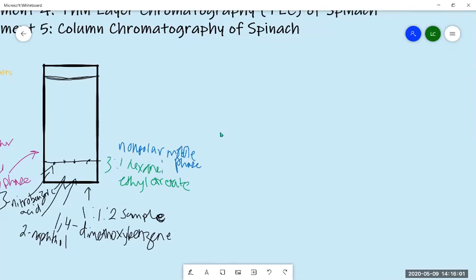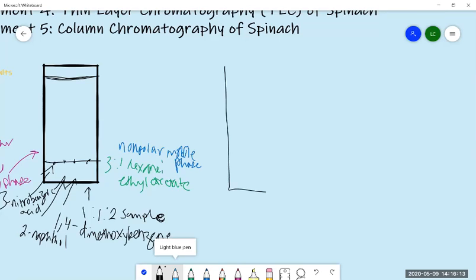Okay, so in your TLC, I drew one there. So you do have a mobile phase and you do have a stationary phase.